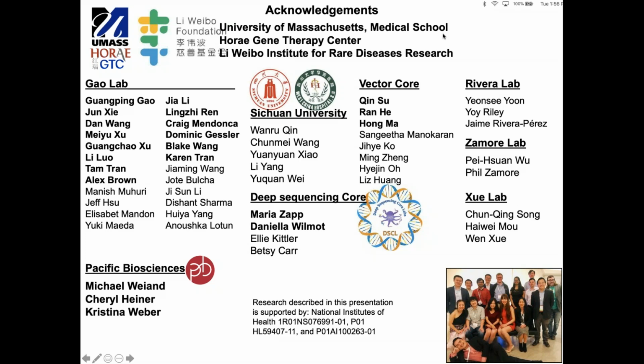For standard application, as long as we get about 20 to 30,000 reads per library, that's where we're shooting for, and that gives us enough representation to pinpoint where truncation events are occurring, or the degree of contaminants, or where these chimeric genomes are coming from.